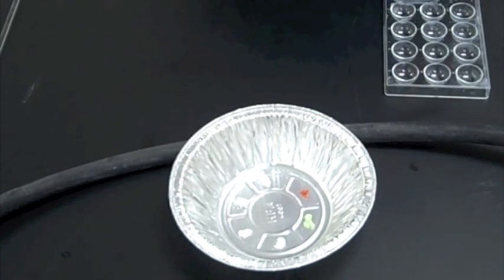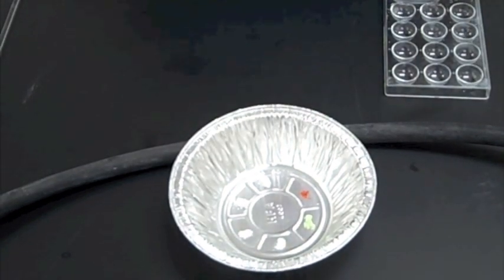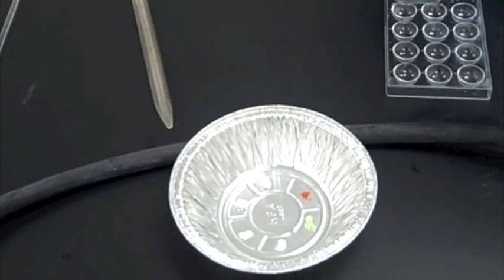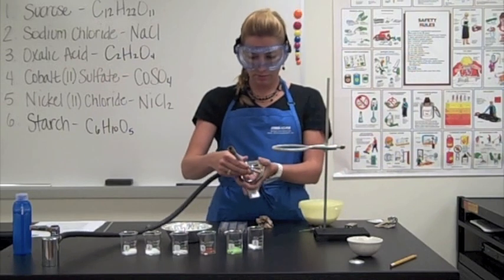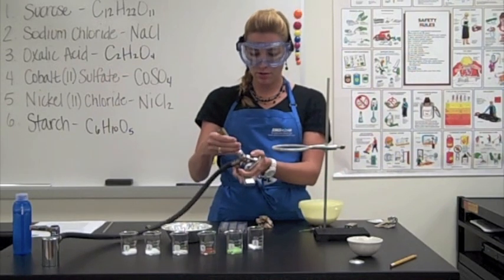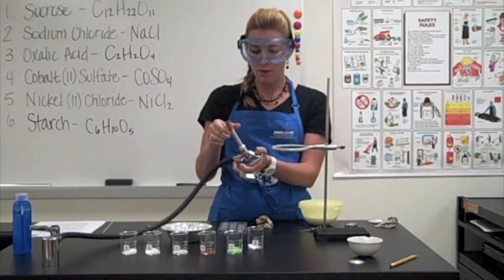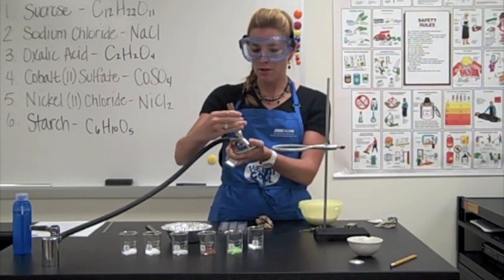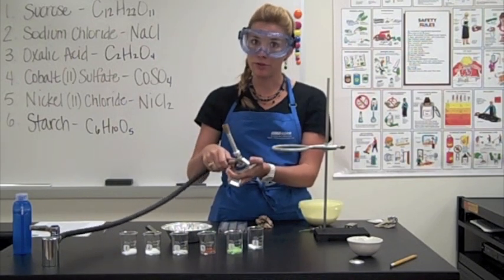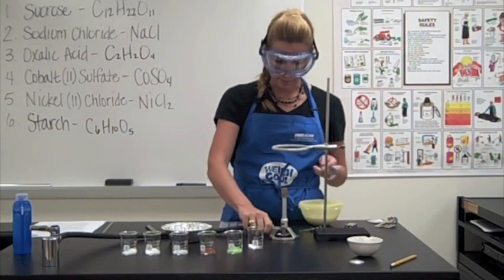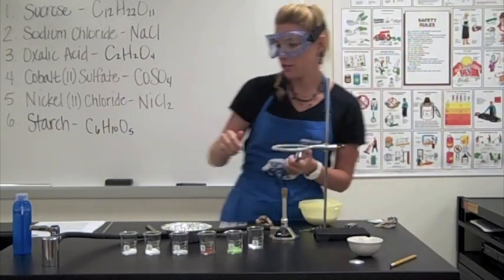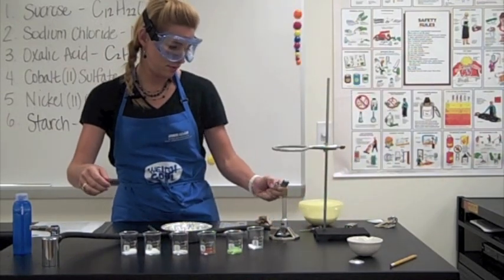Alright, so we have all six of our samples on the plate. We are now going to get our Bunsen burner lit. Remember when you're lighting your Bunsen burner, close the valve all the way and then open it about a full turn. The reason you do this is just so you don't burn your instructor when I come by to light it for you. Once you are adjusted, haul me over.